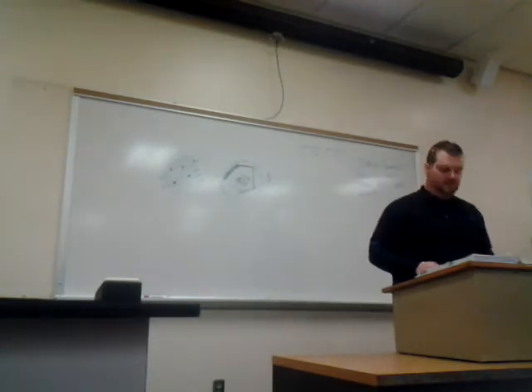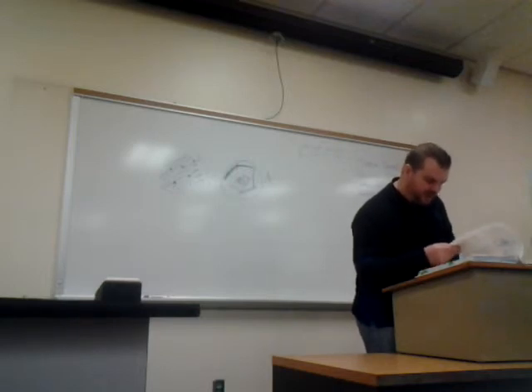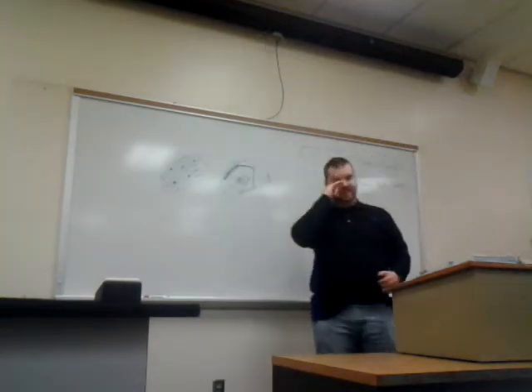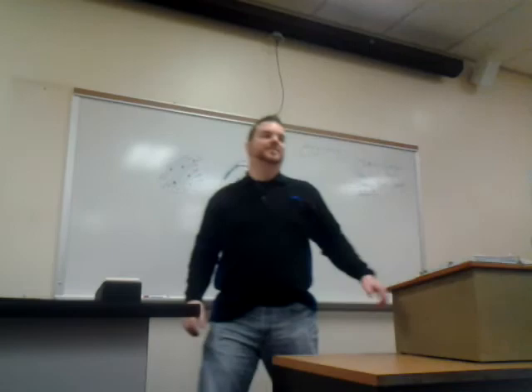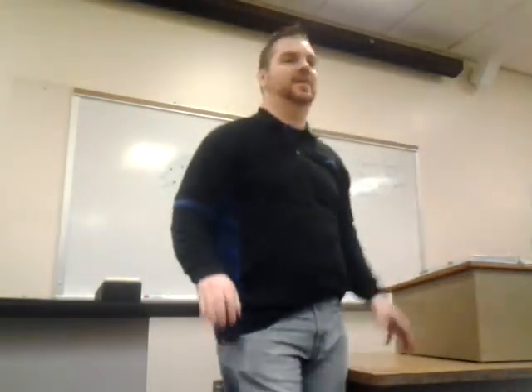Don't all these though have the clear zone? Not all of them though. It's hard to see, it's like the little white halo thing. Right? Yeah, a little halo on it. Like the top 3 or 4 have it, but the 3 middle ones really don't. It's easier to see in your books. Oh, yeah, barely. Yeah, it's harder to see. It's easier to see in person than in a picture of it. Yeah, it's really easy to see in person. I don't see any, whatever, yeah.